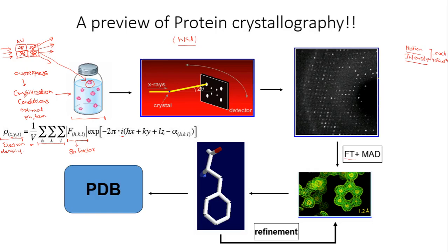Now there is one more factor that needs to be understood. Using the data obtained from X-ray crystallography, you can only infer this structure factor in your Fourier transform expression.